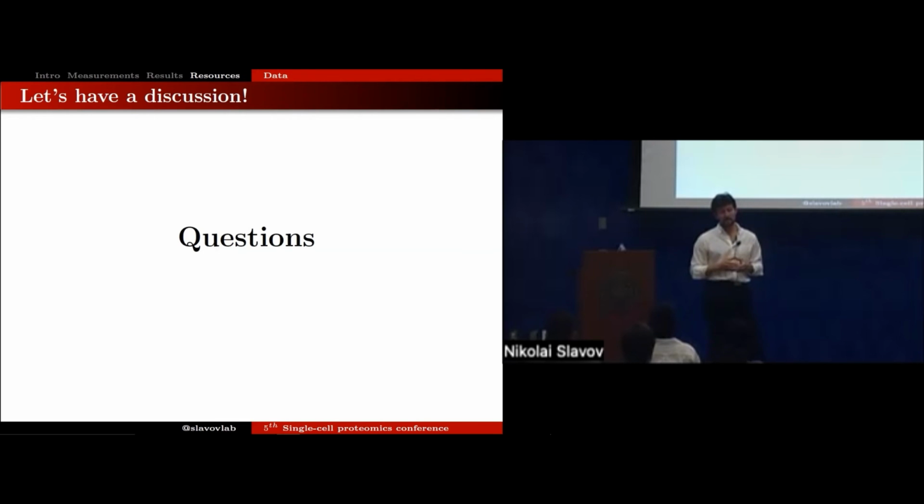As we get to 100 plexDIA, as Andrew asked, we are going to need to further increase the throughput of sample prep. At the moment, it's not limiting, but as we advance the throughput of mass spec, sample prep is going to become limiting again. And as we define optimal, we really have to define our metrics, what we mean by optimality. Andrew is going to talk a bit about that. He has some really good slides of specific, concrete, measurable quantities that we can use to evaluate how good or how poor sample prep is.